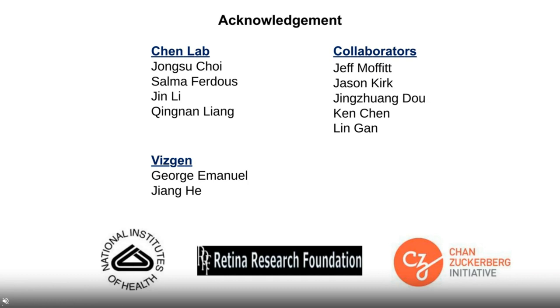Perhaps I can also add a further note on what Dr. Chen was saying about the imaging time. For MERFISH and MERSCOPE imaging, it's often divided into 2 phases. The first phase is off the instrument, sample prep from the histology cutting to hybridization and some of the washing steps. That usually takes a couple of days to prepare the sample. And then there is a second step, which is the imaging acquisition. Again, for imaging 1 square centimeter of tissue with about a 500 gene panel, that usually takes about a day or so. Okay, great, thank you. Next question.